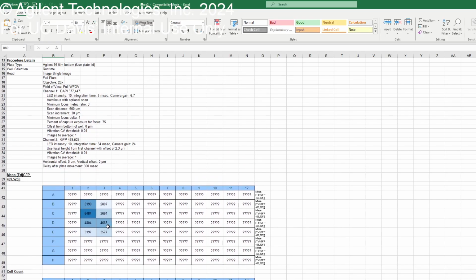Something I do is I want to get the individual cellular data per cell. Is there a way to do that easily? Because I know you can. Yeah, I can show that.